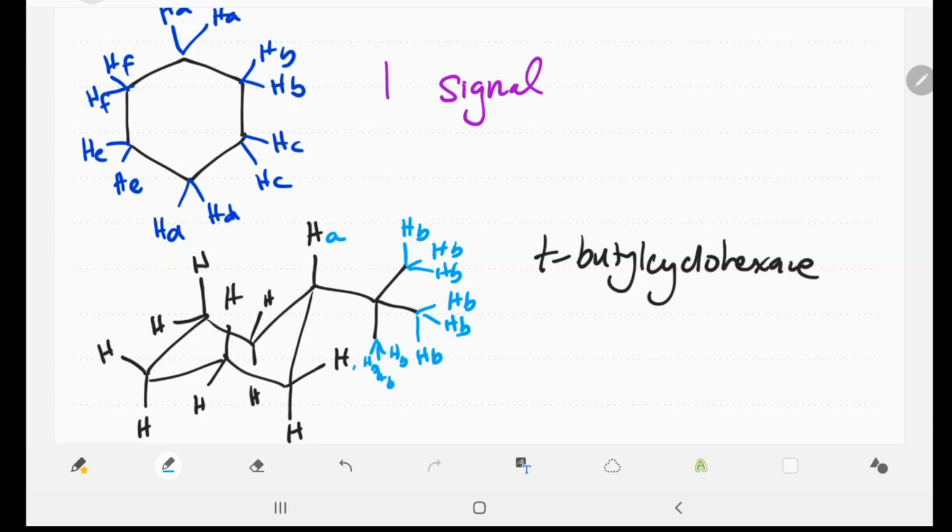We're going to see that this would be different than that because the hydrogen C is equatorial. Remember, this thing is not going to flip. The T-butyl group is never going to be axial. So because it's not going to flip, you'll be left with more specific ones. You'll probably see these, at least 6, and the rest would probably all glob together.